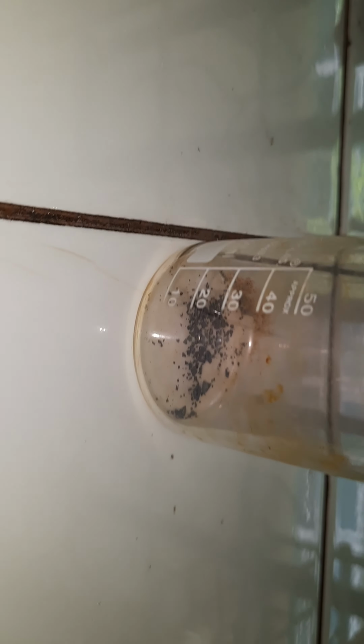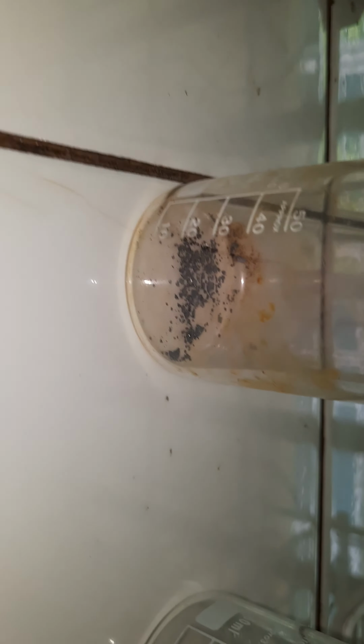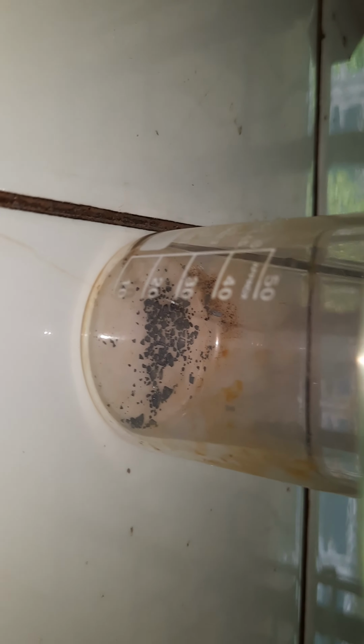crystals, look at this. There are already smudges. Take note, earlier the beaker was as clear as the beaker holding our mercury sample. Now, look at what happened to the walls of the beaker containing iodine crystals.